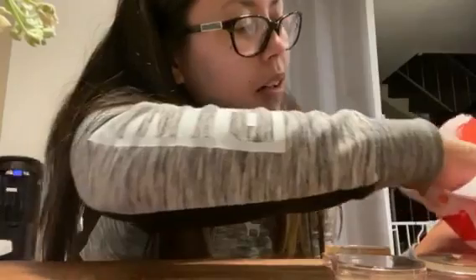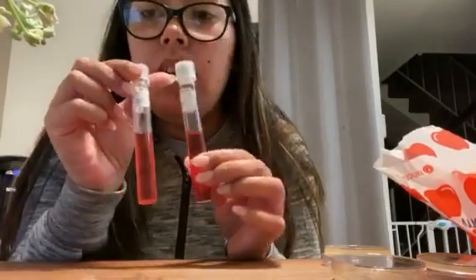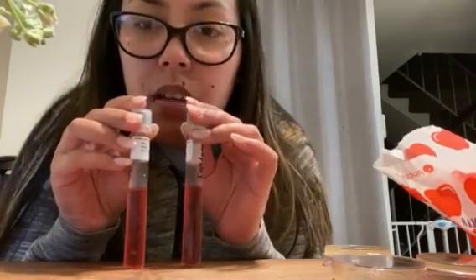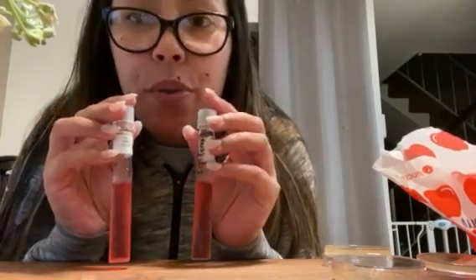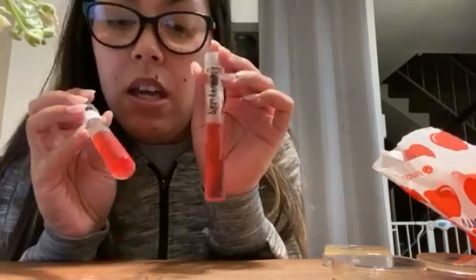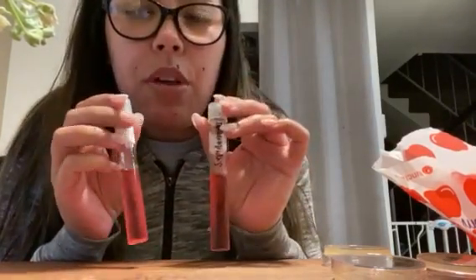I noticed that with my tubes, the E. coli and the S. epidermidis both developed at the same rate. They maintained the same color of the broth, the natural broth color, and their turbidity was pretty low. It's still really clear and you can see through it. I noticed that the only cloudiness was towards the bottom of the tube, where you could see some growth happening.